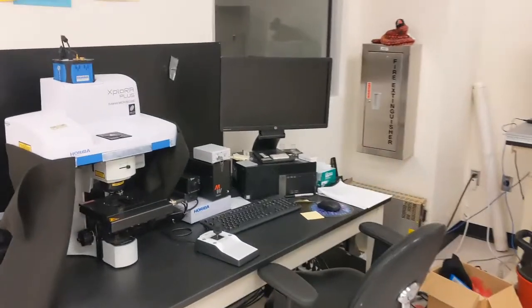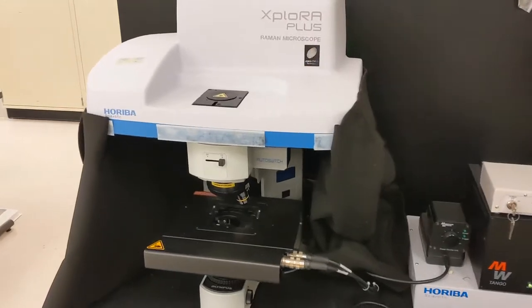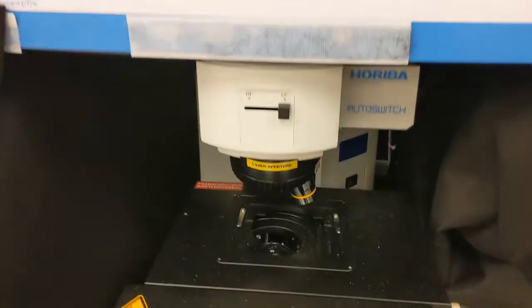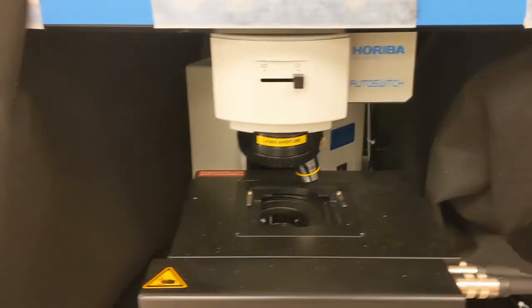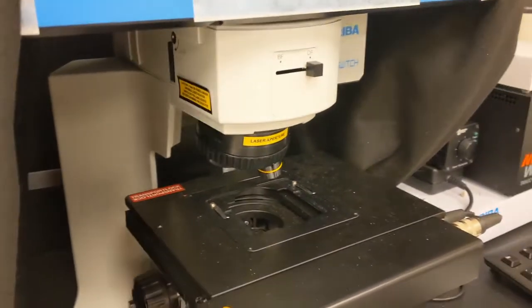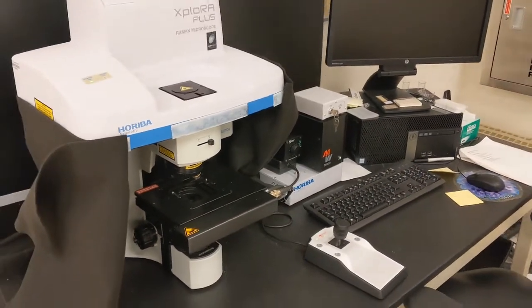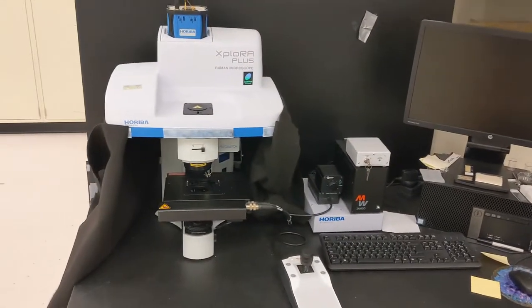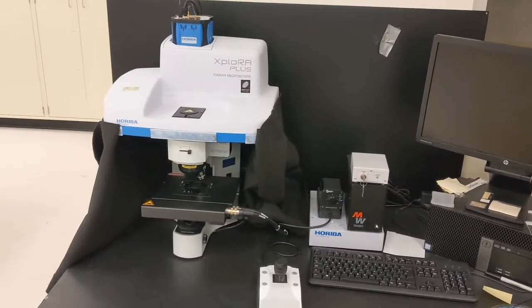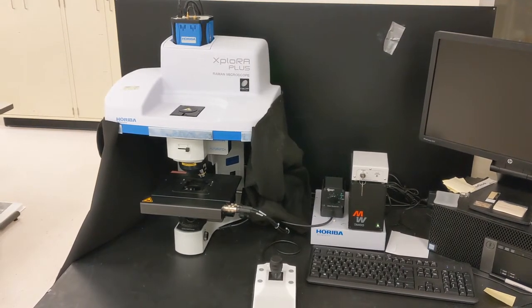This is our Raman microscope. It uses a visible light laser to produce a characteristic spectra of the mineral that you are analyzing. This spectra can then be used for identification purposes, or we can use it to detect how crystalline a sample is. For example, zircon becomes radiation damaged, and we can use this Raman to quantify the amount of radiation damage that it has had.